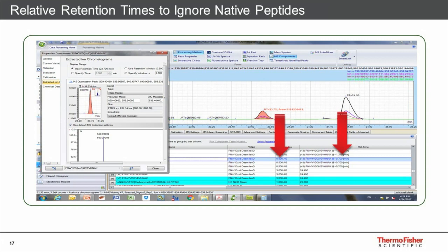Here's ISO-D from one of the stress samples that we have. So here's the main feature, and here's the ISO-D. It's around 20%. In the control sample, it's about 0.1%. How do I make the software not just pick this automatically? So if you go into like Skyline or Pinpoint, it's just going to pick the biggest one and grab this all the time. What you can do in this method for MAM is you can actually say, go find this one. He's at around 1E9.